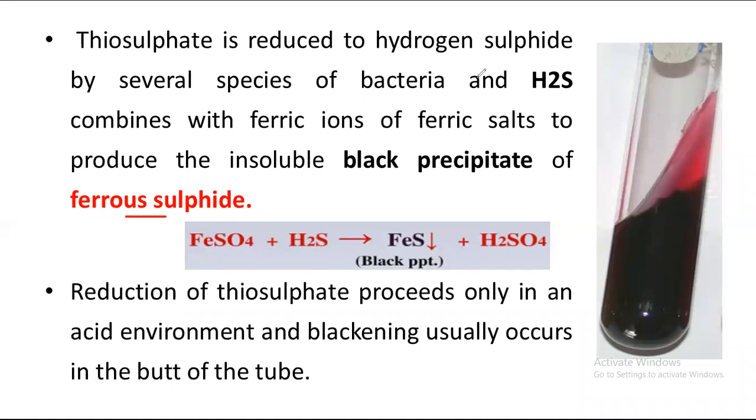It has not fermented glucose or dextrose and sucrose. It has only produced the thiosulphate reduced to hydrogen sulfide by several species of bacteria, and hydrogen sulfide combined with ferric ions present in that media and produced an insoluble compound that is known as ferrous sulfide, and that ferrous sulfide is black in color.